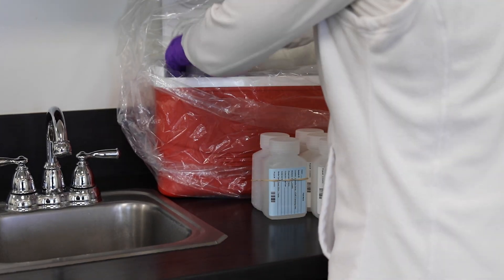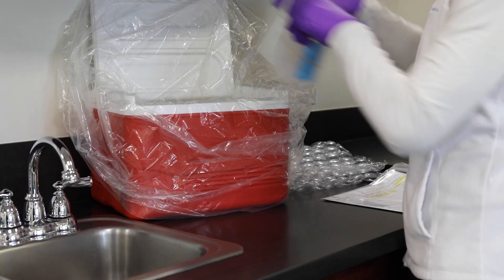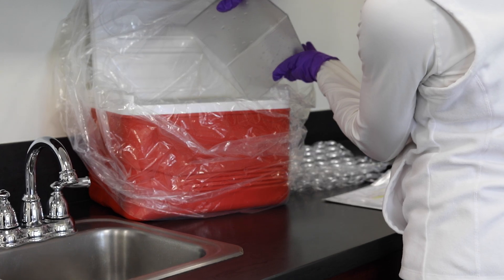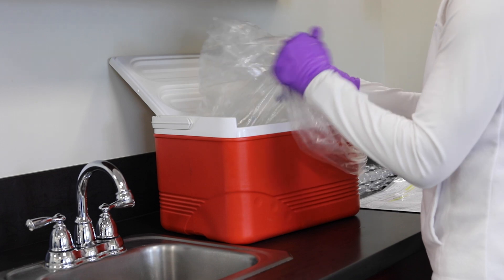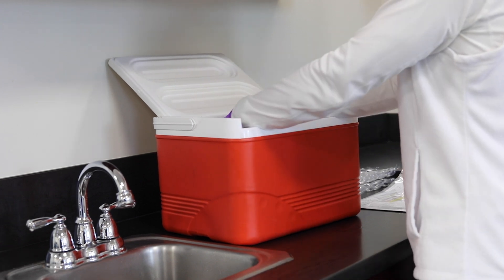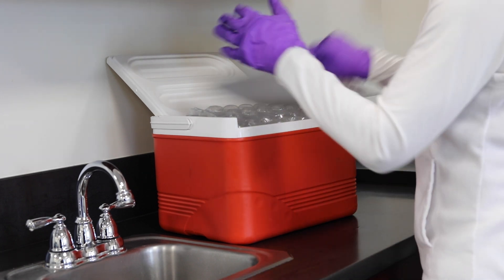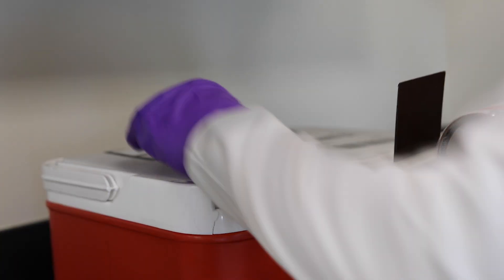Place the sample and FRB bottles into the liner bag. Be sure to put wet ice around the bottles and then additional wet ice on top of the bottles to fill the cooler almost to the top. Gather the liner bag and twist it tightly, then tuck it into the side. Place a layer of bubble wrap across the top to keep the bottles and wet ice in place. From there, put the COC in a sealed plastic bag on top of the bubble wrap. Close the cooler and seal with tape.